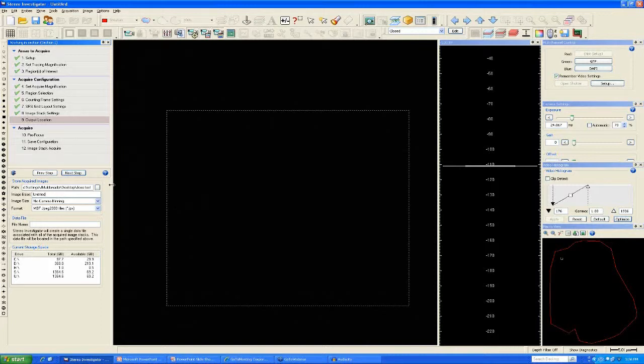The images generated by the SRS Image Stack Acquire workflow will be titled whatever you name here, for example, webinar, followed by a series of numbers. In this way, each of the images of your Z-stacks will have a unique name, making it easier to identify and find it at a later time.